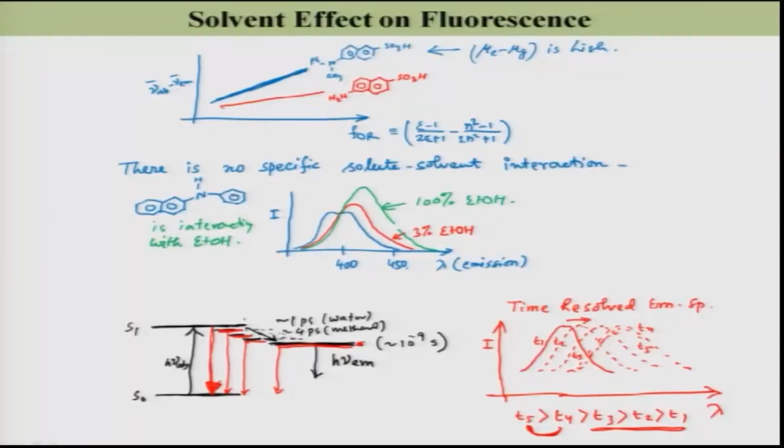If I am able to measure the time resolved emission spectra, I will be able to see the formation of this state through the intermediate states, and that is a very interesting topic. The time scale of going from this state to this state is known as the solvation time, and the dynamics is known as the solvation dynamics. Eventually by this we will get the solvation dynamics of the solvent of your choice. As I said, in water it is about 1 picosecond, and as you change the solvent to methanol it increases, 4 picoseconds, 5 picoseconds, and so on and so forth.